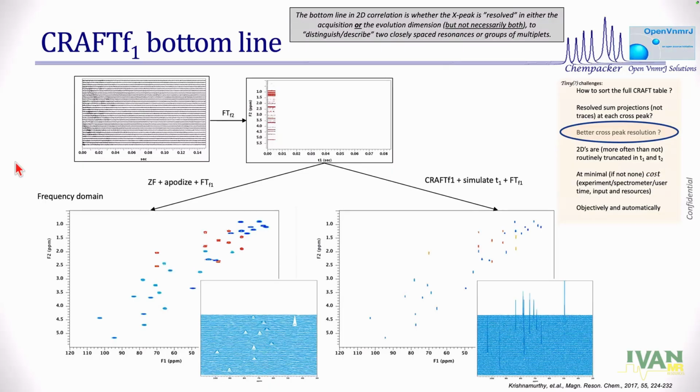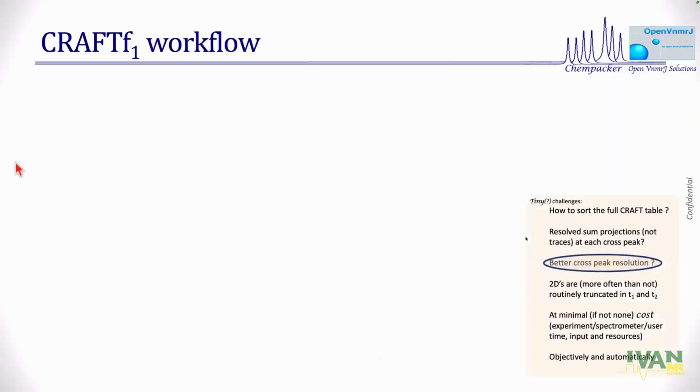And in FT, zero fill, apodized FT, excellent looking 2D spectrum, falls behind what you can do simply by going through a tabular domain. That's it. Yes, you do always have a question of Bayesian. I'm just going to defer you to previous work already done. But it is what we can do with the tabular domain. I'm focusing on what can we do with the tabular domain.